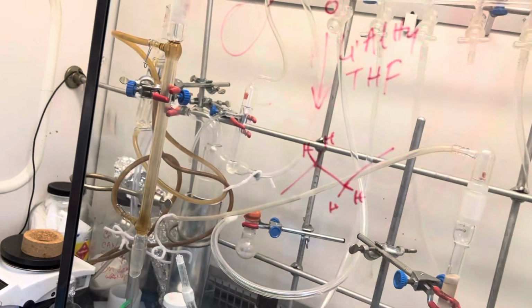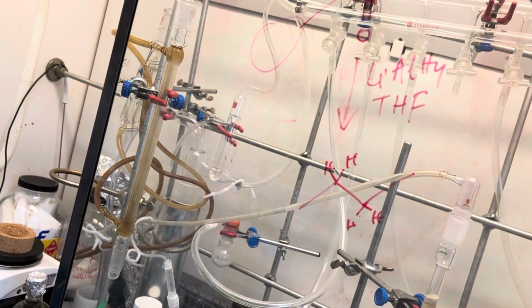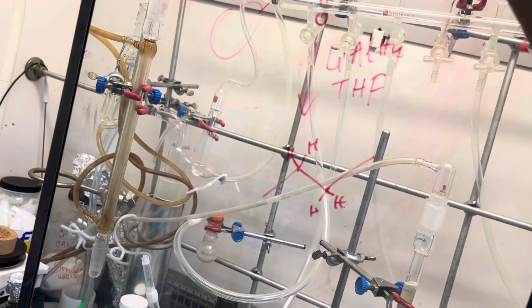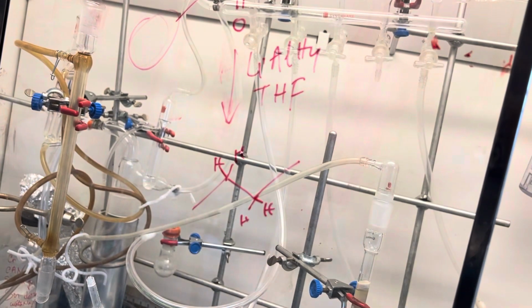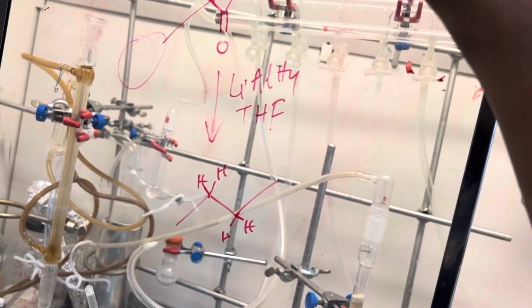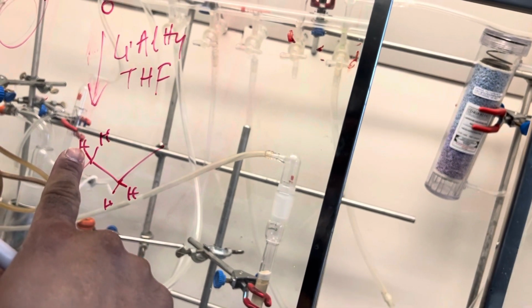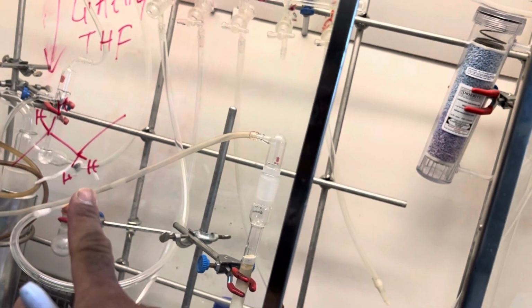I'm not seeing your full structure, but originally in the aliphatic region you don't have too many crowded peaks. There is no proton there, except there should be a singlet around 5.2. But if this carbonyl group gets reduced, that CH2 will appear around 0 to 2 ppm maximum. It should show two triplets, because this proton sees the two neighboring protons, 2 plus 1, a triplet, and the other proton likewise.